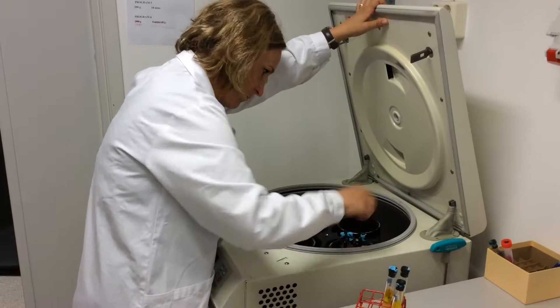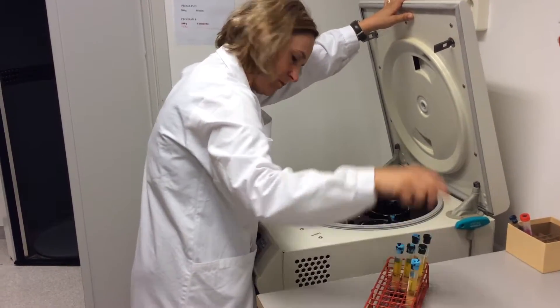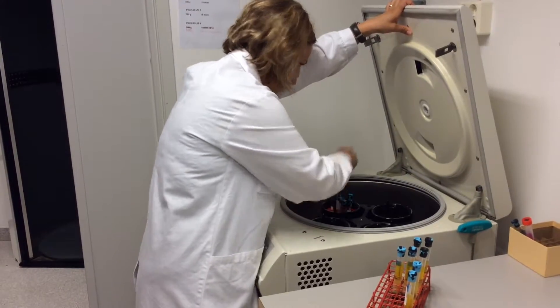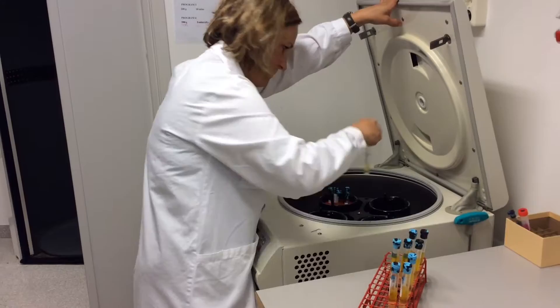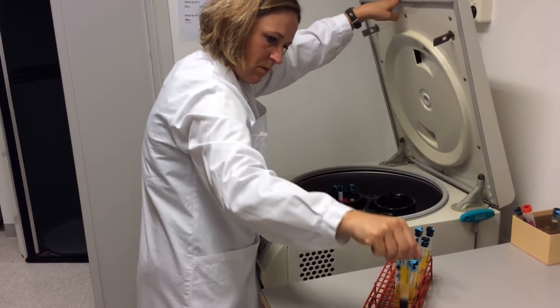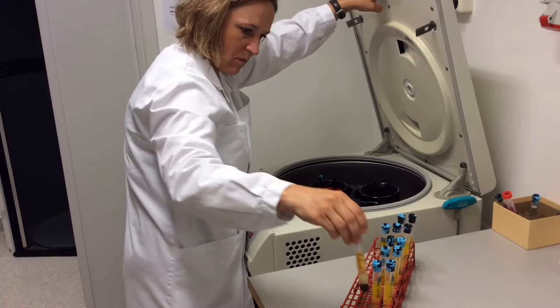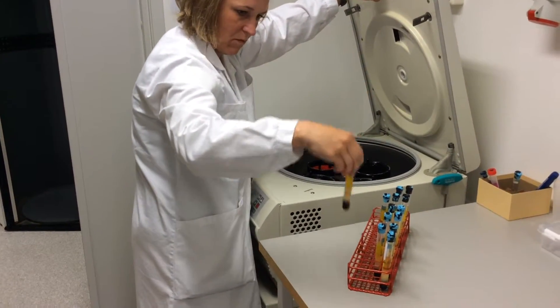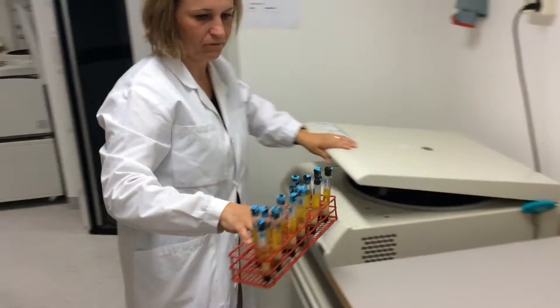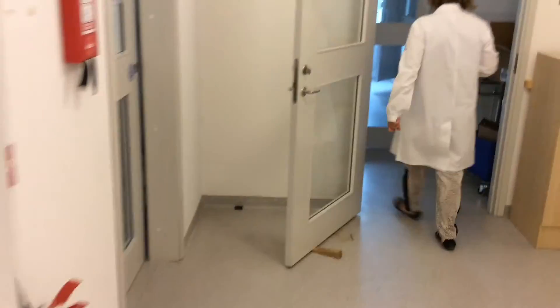The first spin for the PBMC process is now finished and Magdalena is taking up the samples from the centrifuge. She is sorting them by subject, then walking to the sterile room where she will process the samples in the hood.